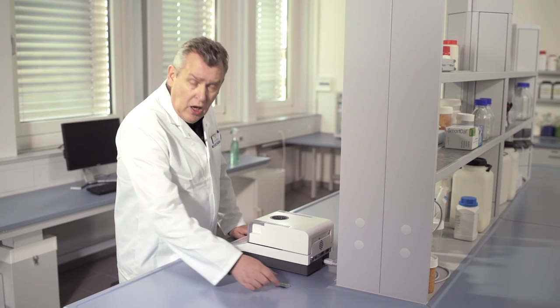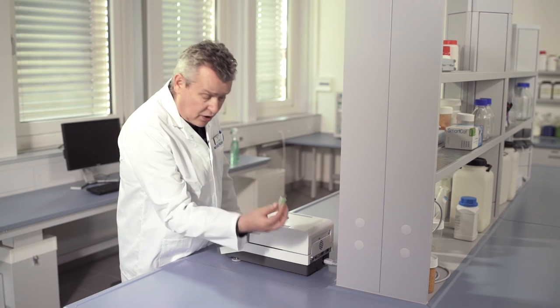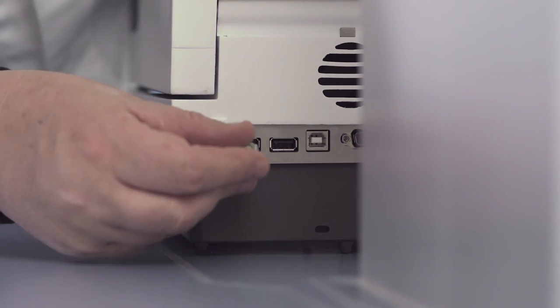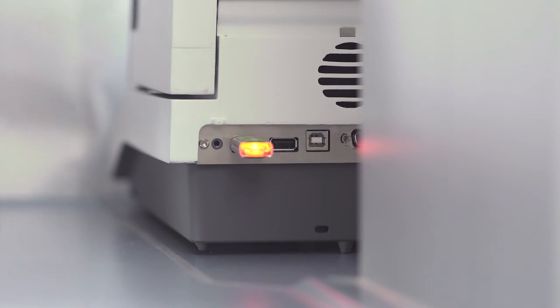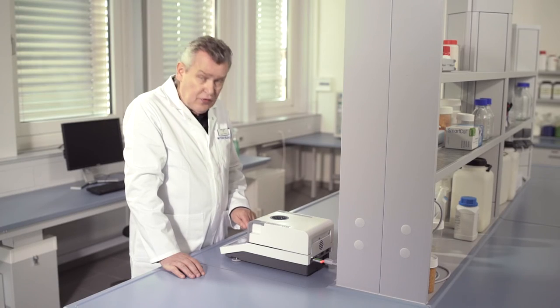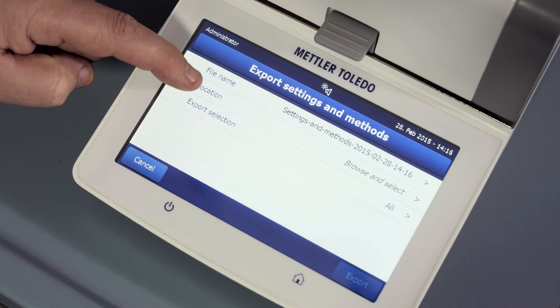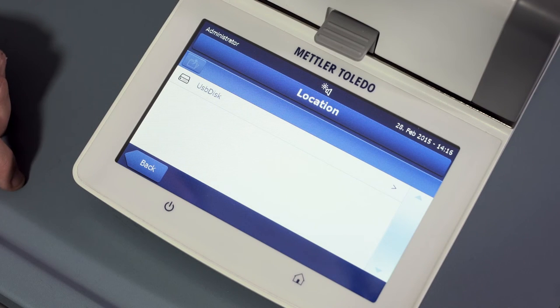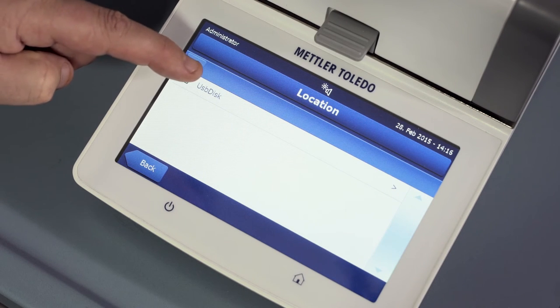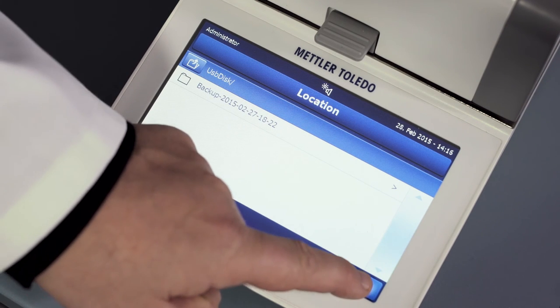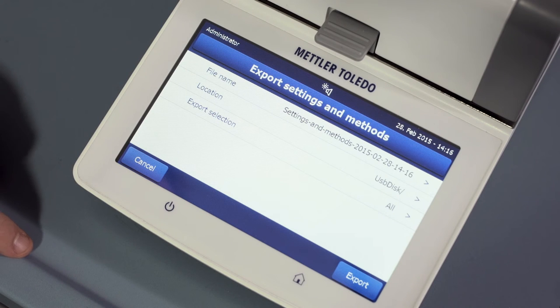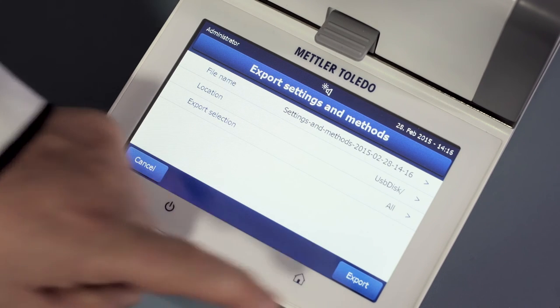Now, plug in the USB flash drive, and select the USB drive under location, and export the settings.